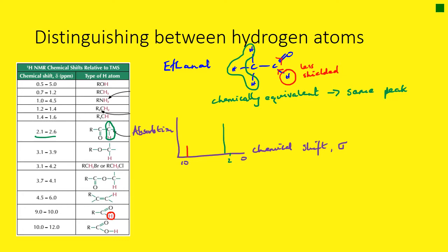Let's do another molecule. Let's do propanone. The first thing we can do is draw out propanone. 3 carbons. And it's a ketone, so the carbonyl carbon needs a carbon on either side. So this one has to be the carbonyl carbon, which means we've got 2 methyl groups here with hydrogens on the bonds, like so.